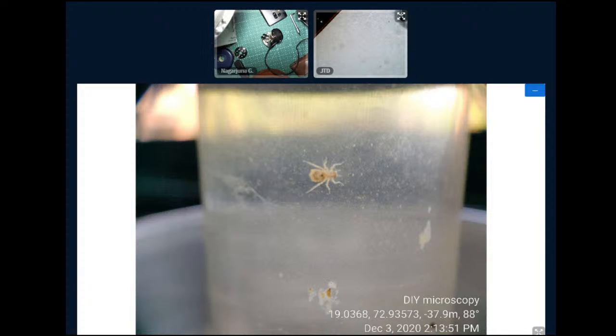So the only easy way for us to do this is to do barrel polishing. That means you have to get that fine emery powder that watch repairers used to remove scratches from the lens, put it in a small box, put these glass beads inside and shake this continuously. So whatever is out of the spherical plane gets ground away totally. Oh, that's interesting.